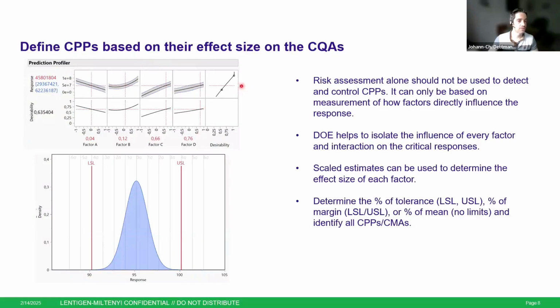So after we have now designed our DOE study, we would then go into the lab and perform all the experiments, collect all the data, and use this then to define our statistical model, which is the representation that describes the relationship between our input variables, the factors, and our response.